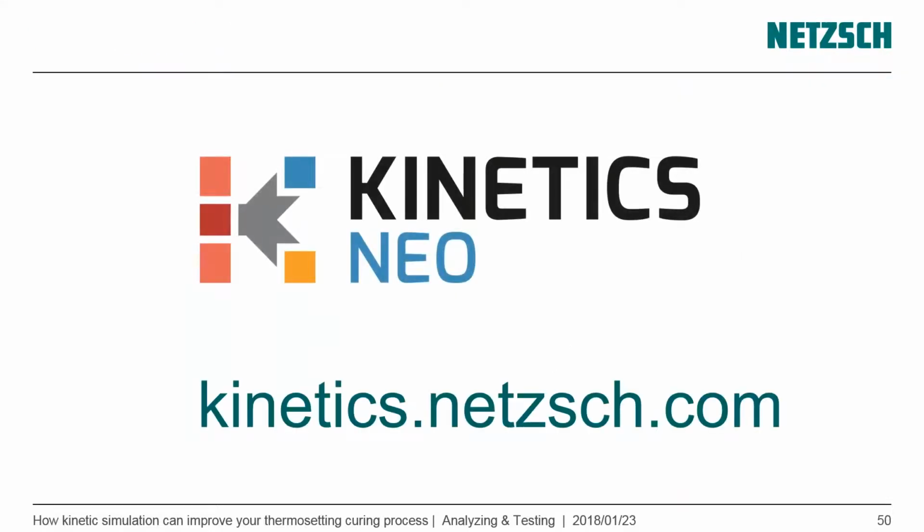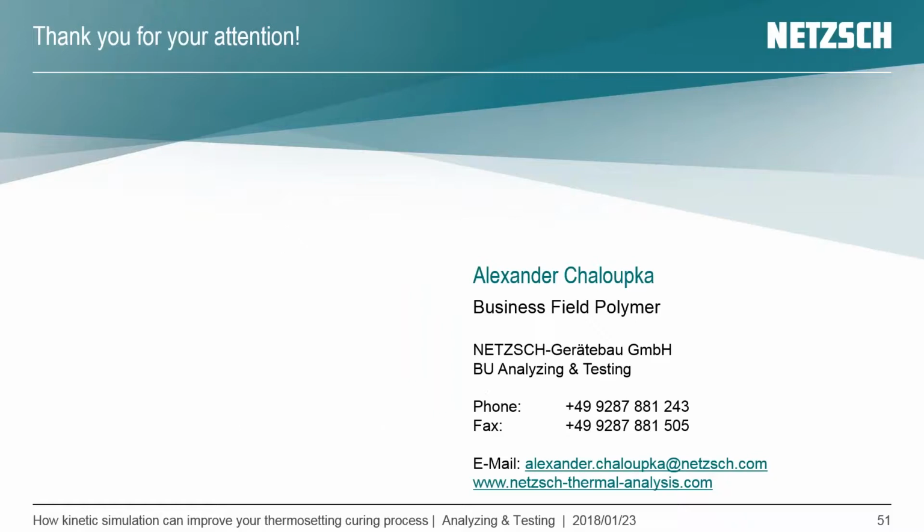So this was the short introduction from my side into Kinetics NEO. Now I'm open to your questions. I can see there were some questions during this webinar. I will have a look at that. Please give me some more questions. We have a lot of time to talk about that.